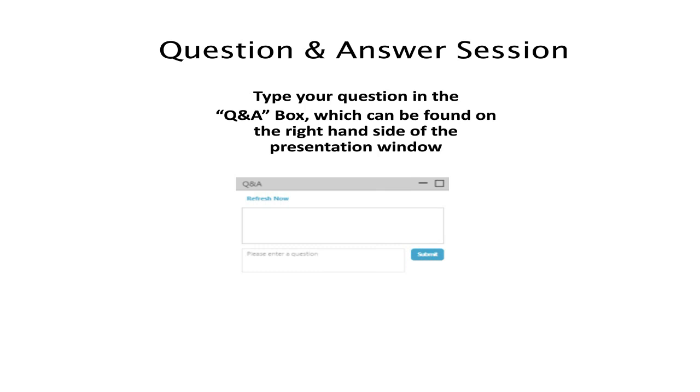The sample does not need to be encased in epoxy for the sake of the analysis. Now, it's important to point out that ATR imaging, of course, is an ATR measurement, and so contact between the crystal and the sample is very important. So long as there is a preparation technique which is available to present a flat and even surface to that crystal, then a high-quality infrared measurement will be available.